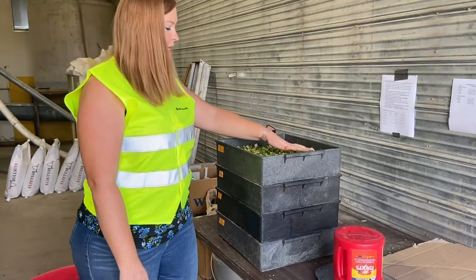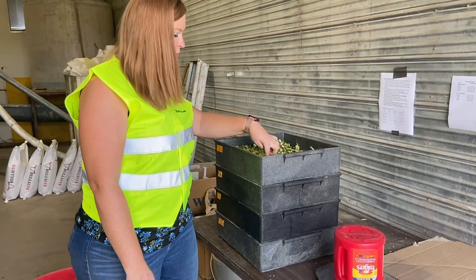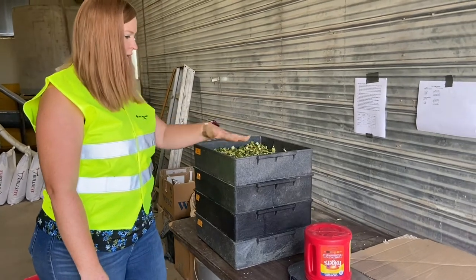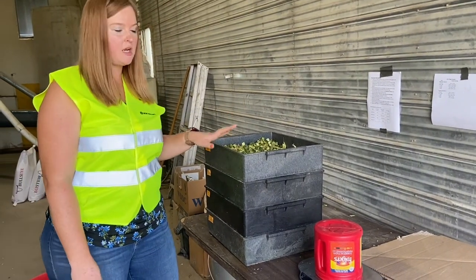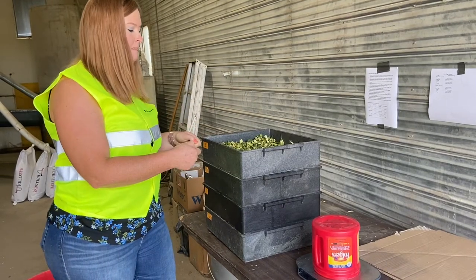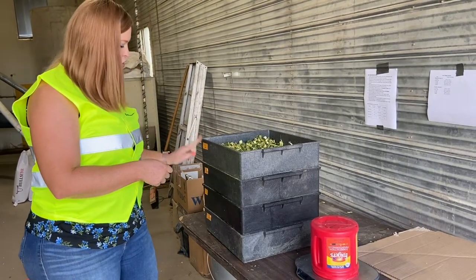You want about an inch of sample on the top. Some of it is already going to fall through — don't worry about that. Just spread it out. When you shake, you shake 5 times and then you rotate, and you do that 8 times, so it's 2 full circles.